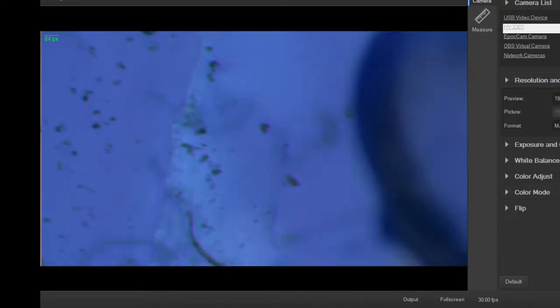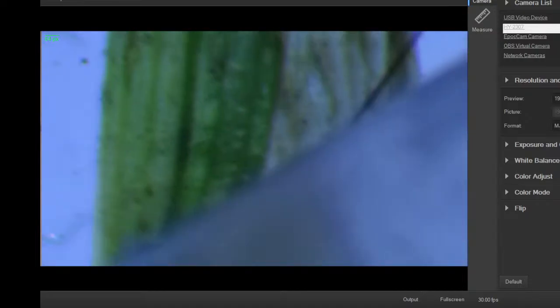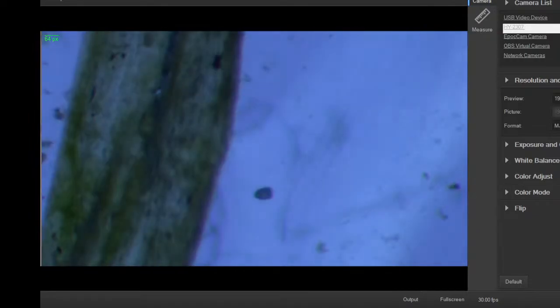Friend the tardigrade. If I remember correctly, it's about the same size as that mite. So it should be pretty easy to find it again. We're finding all kinds of mites.